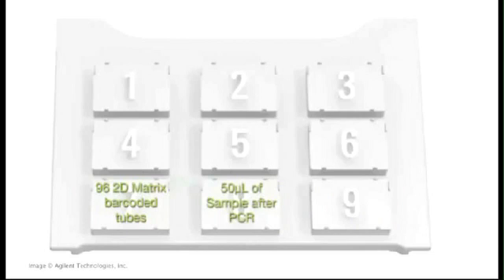In the middle, position 8, is the actual PCR'd 50 µL sample — there are 96 samples in this plate. On the right side, position 9, is the magnet, which will be used to separate the beads once our DNA has been bound.